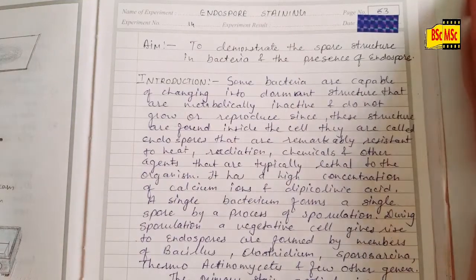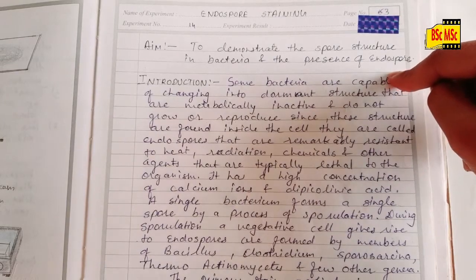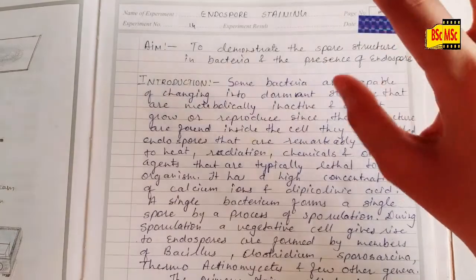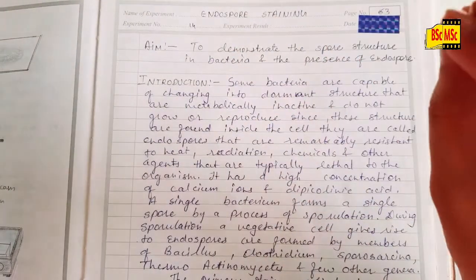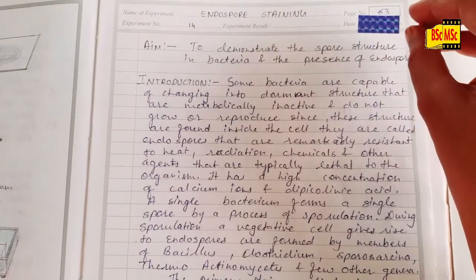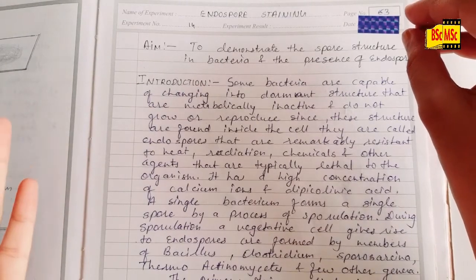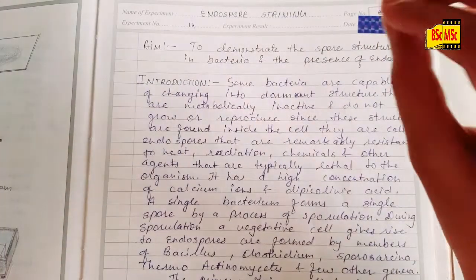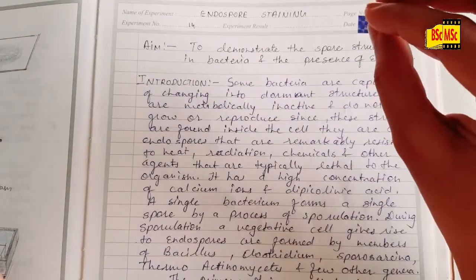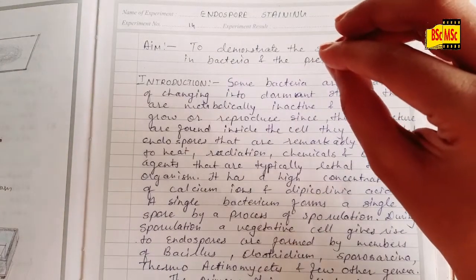Okay, let's start. The aim is to demonstrate the spore structure in bacteria and the presence of endospore. Endospores are present in some bacteria, and endospores are typically inactive, dormant, and they don't reproduce. A few key points are important about the endospore: endospores are resistant to heat, radiation, chemicals and other agents, so it is typically lethal to the organism.